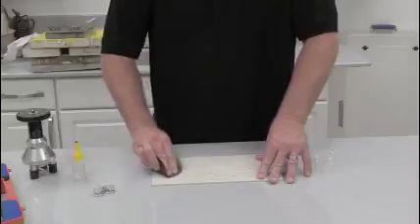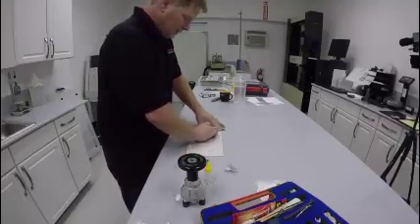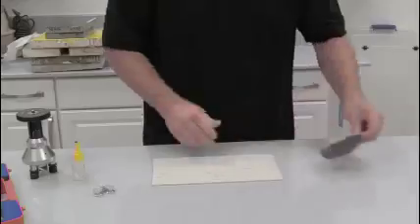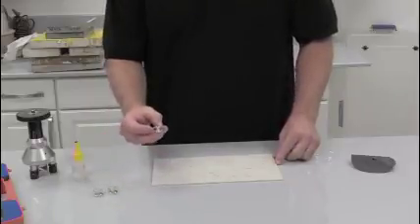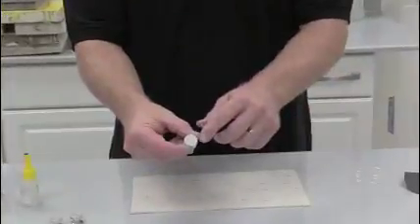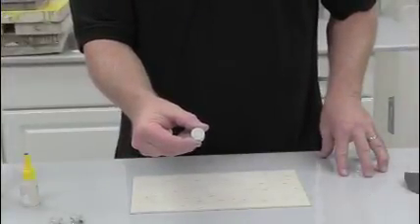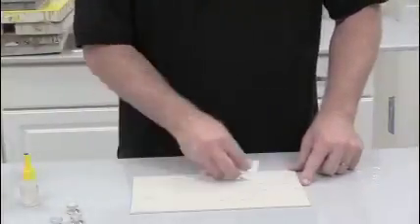I'm going to sand a couple of spots lightly, then wipe them off and apply a three-quarter inch dolly. The dollies are actually abrasive blasted just to help get good bonds so we don't have a bunch of glue failures. I'm going to wipe off any dust from my areas.